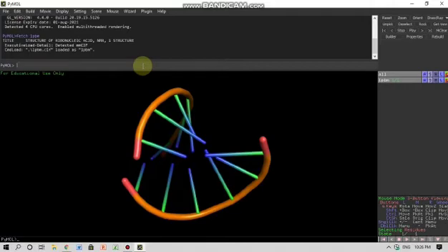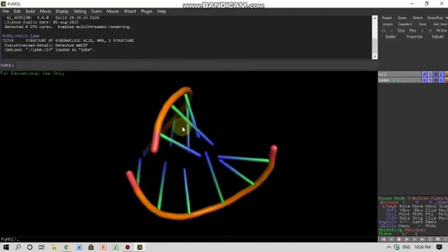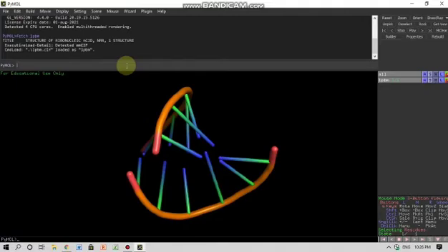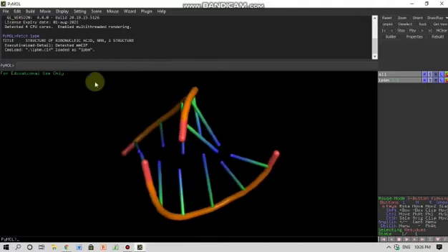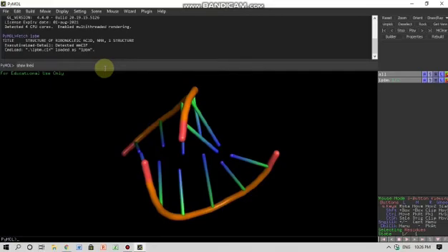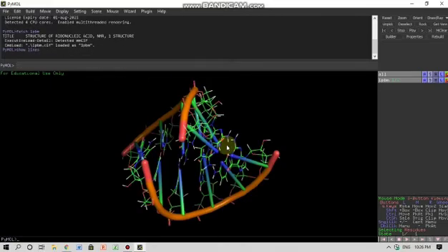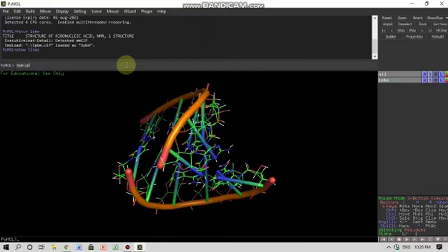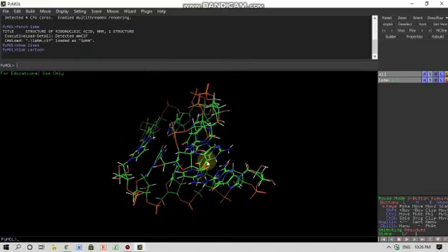If I want to change the shape of this particular molecule, I can write here in the command line the different shape that I want to see this molecule in. I can write here show lines, then I will enter. So this will show up. I don't want to see this cartoon so I can write here as hide cartoon and then enter, so the cartoon disappeared.